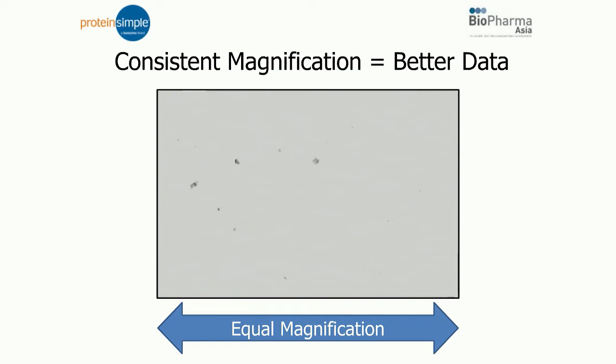So MFI was designed so that in our entire field of view, so in all the data that we capture, the level of focus and magnification is equivalent. And this allows us to more equally compare and more accurately size and count all of the particles that we gather.